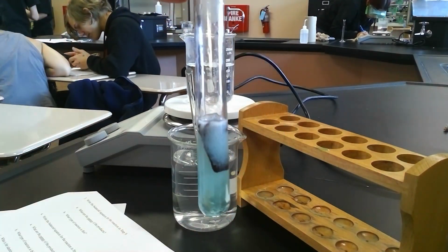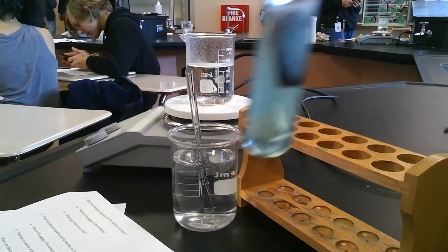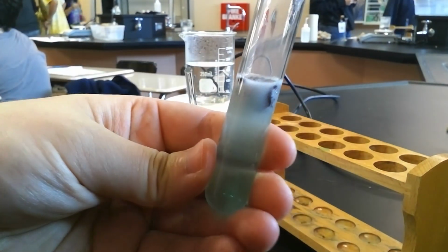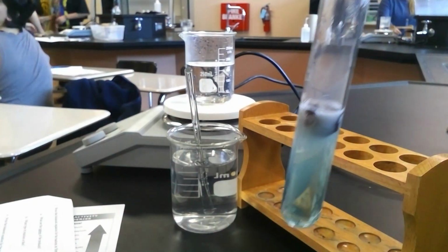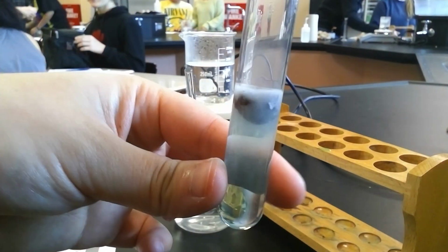So definitely lots of bubbles in here. You see some foaming. It's almost like a rusty sort of color, but this is not rust that's forming. So students who are saying that they observe rust forming are incorrect, because rust is made of iron and there is no iron present in any of this. If I touch this, it is getting noticeably warmer, so it's not correct to assume that because you see bubbles it's warm, but feeling it, definitely note the temperature change.